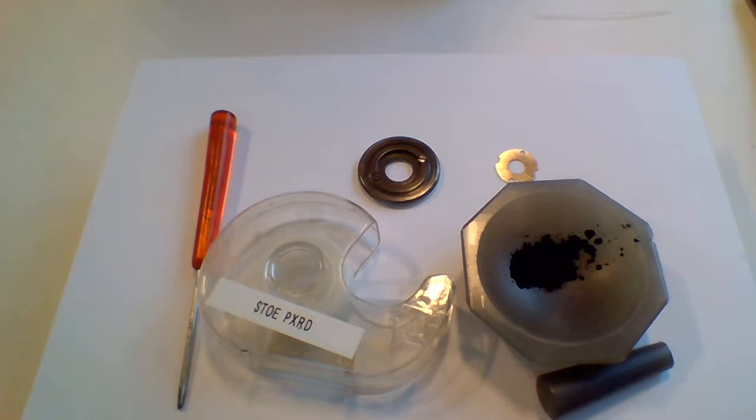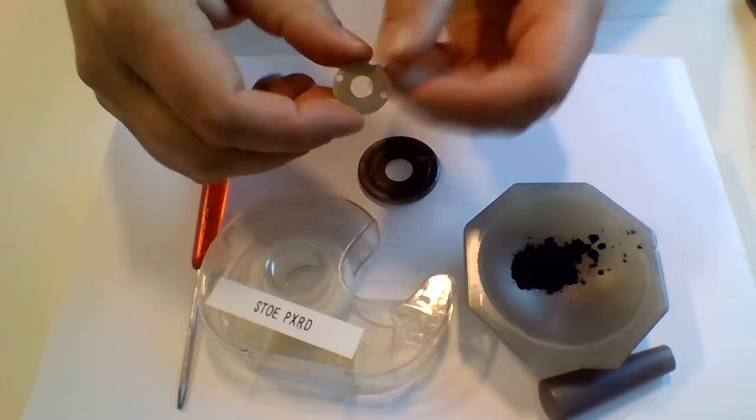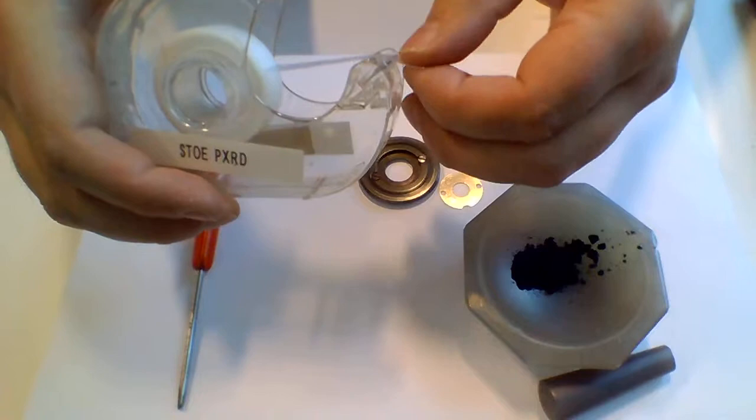In this short video I'll show you how to prepare a sample for Stoei. Stoei is using transmission geometry. The sample itself will be mounted on this small ring using simple sticky tape.